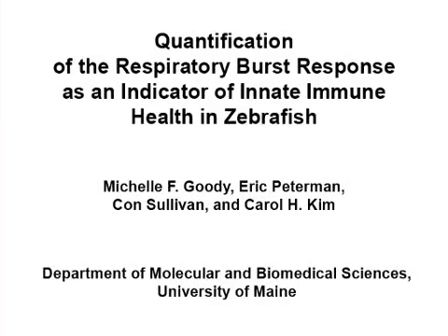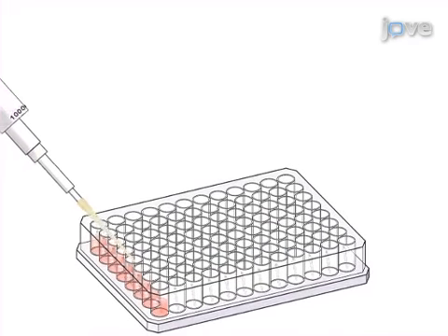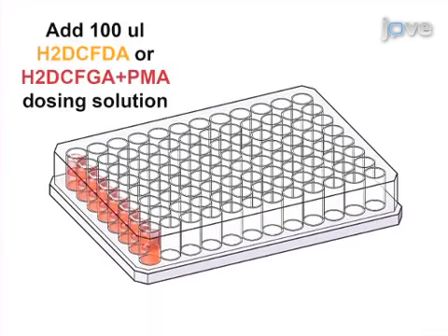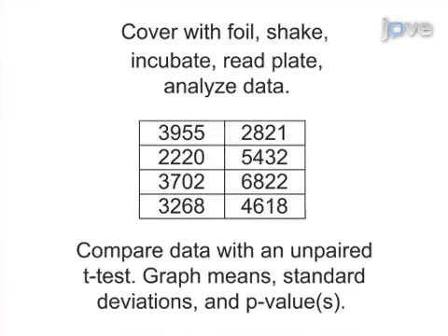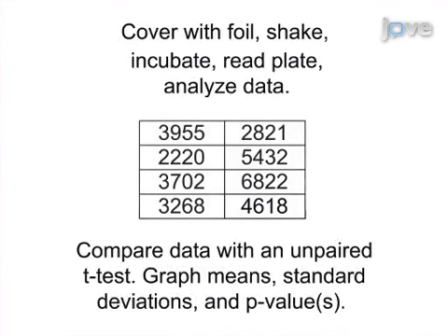The overall goal of this procedure is to use fluorescence to quantify the respiratory burst response. First, load the zebrafish embryos into the wells of a 96-well plate. Then, add a fluorescent substrate and activate the respiratory burst with a chemical agent. Then, quantify the relative fluorescence using a fluorometer. Ultimately, the fluorescence is used to show the respiratory burst potential.